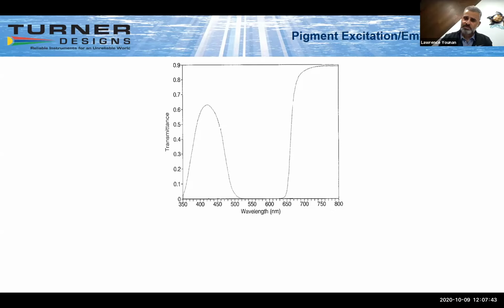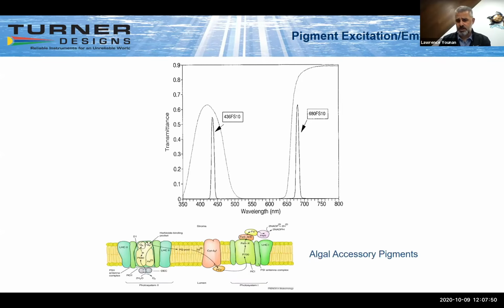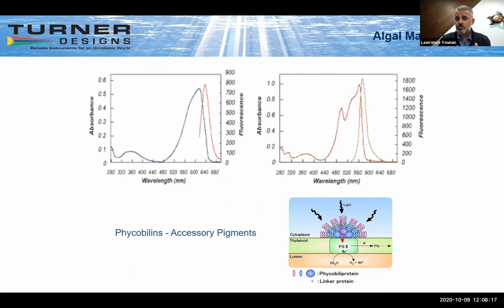So with the advancement in optics, we are now able to choose these really narrow band filters. As a matter of fact, this filter pair that you see on the screen here is specific for looking at chlorophyll and only chlorophyll a. It was configured, defined by Dr. Nicholas Welschmeyer. Maybe some of you know him. He's my advisor back in grad school, but he did work in 1994 to define this wavelength pair, because we had that ability to now target specific marker pigments. And now we can do that with multiple marker pigments that we find are easy to target.